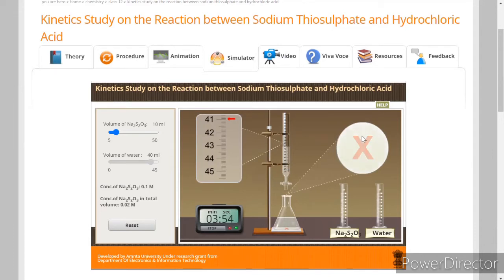We will see what time the reaction finishes. Oh, the time is 5 minutes 43 seconds. Okay, so this is flask A.